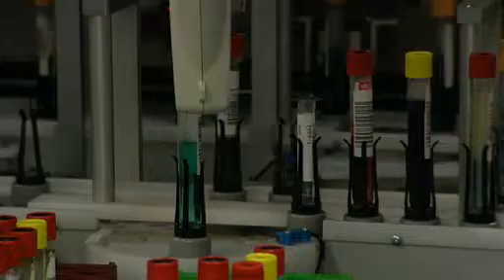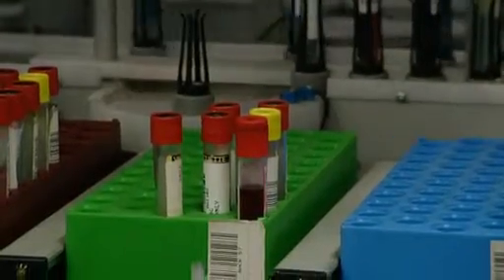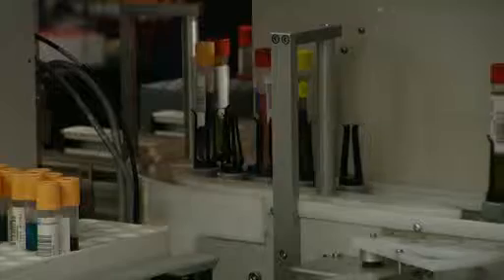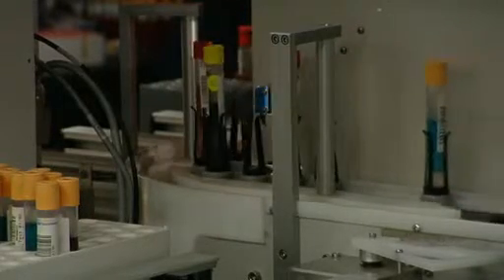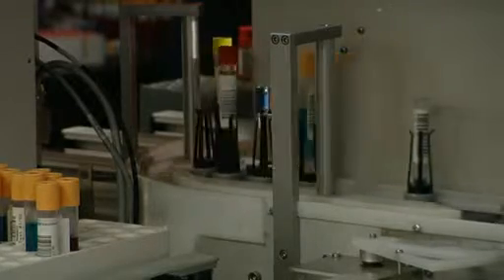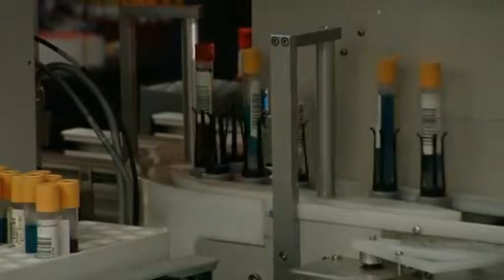So our auto sampler was capable of feeding up to 500 samples through this instrument, and we ended up with that particular product getting an OEM contract with a Swiss manufacturer of inductively coupled plasmas and exporting that product worldwide. So the unique feature in that product was the ability to extend the product even after you'd purchased it, from handling just 100 samples up to 500 samples for those really busy laboratories.